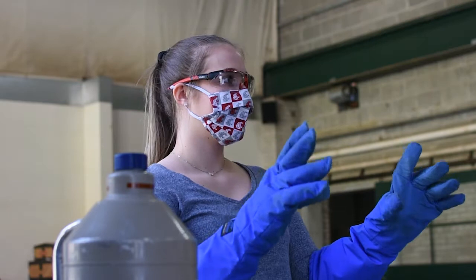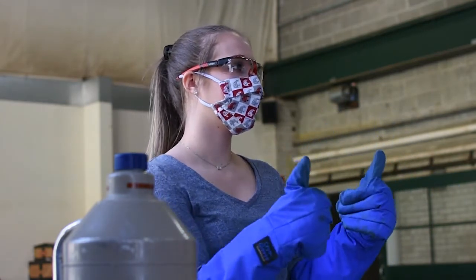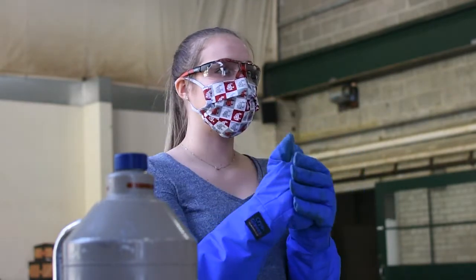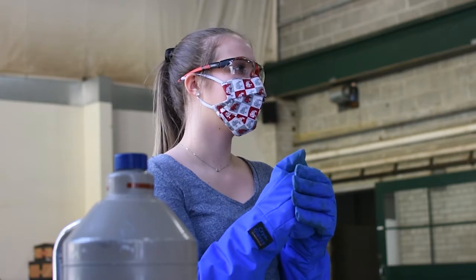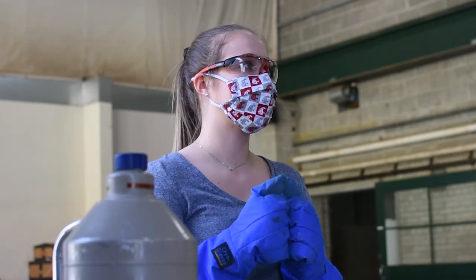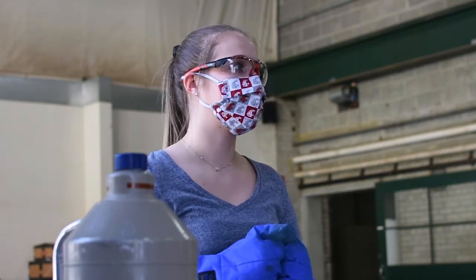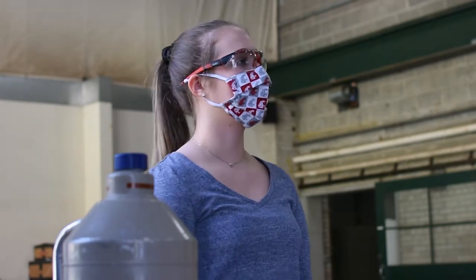Did you show the gloves and the safety goggles? Did you explain why we always wear safety goggles with LN2? You don't want LN2 in your eyes. The droplets will literally freeze the outer layer of your eye, leaving a gray spot. That'll take a while for your eye to grow over. And so that's another place where the LN2 can get caught in your body: your eyes, your mouth, your ears. We never want liquid nitrogen getting trapped somewhere where it can't push itself away from us.